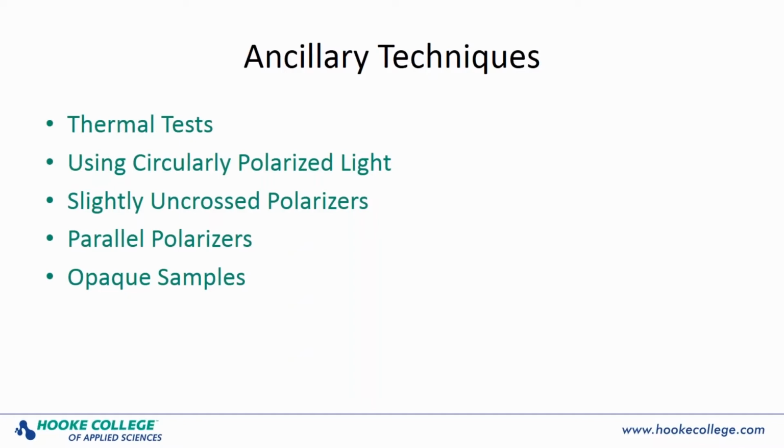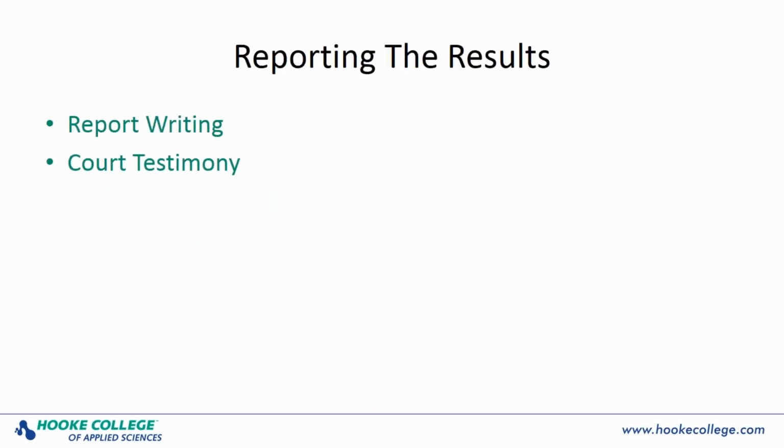What about particles that don't transmit light? Opaque samples, such as graphite or metals, may require alternative forms of illumination and additional chemical tests. But even these samples can be classified and characterized by microscopical techniques. Reflected light can reveal color, luster, and surface features such as pitting or striations. Microchemical tests may confirm elemental composition.